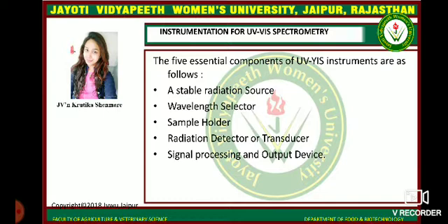A spectrophotometer is an instrument for measuring the transmittance or absorbance of a material as a function of the wavelength of electromagnetic radiation. The key components of a spectrophotometer are a source that generates a broad band of electromagnetic radiation, a dispersive device that selects a particular wavelength from the broadband radiation of the source, a sample area, and one or more detectors to measure the intensity of radiation.